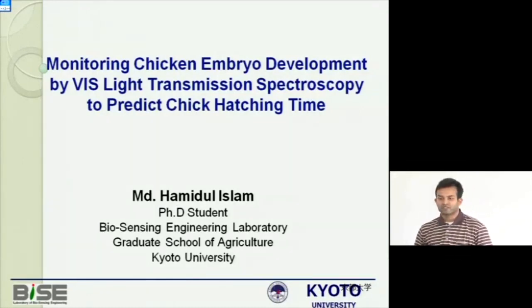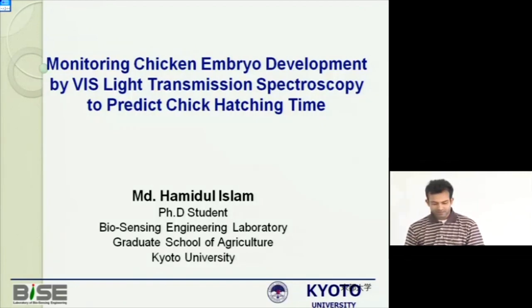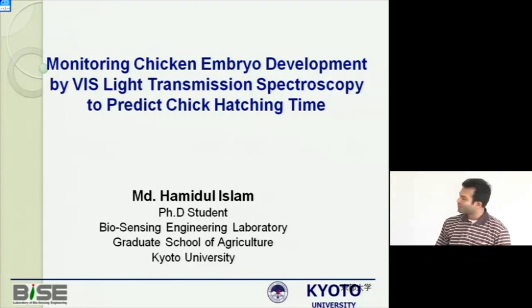My presentation topic today is monitoring chick embryo development by visible light transmission spectroscopy to predict chick hatching time.